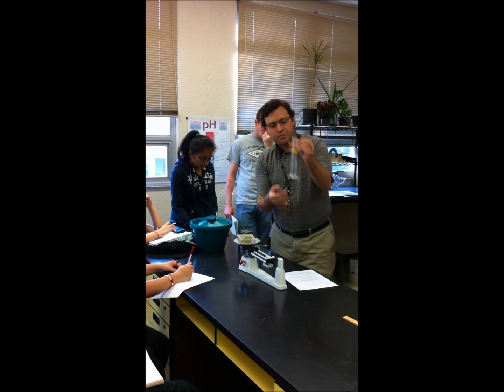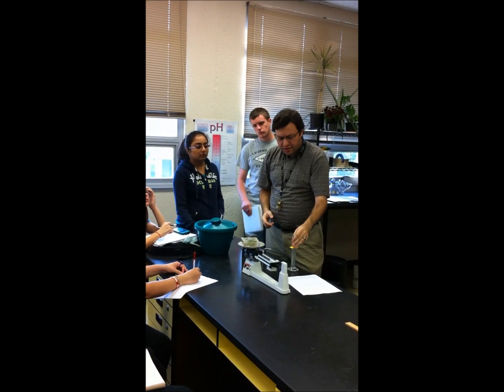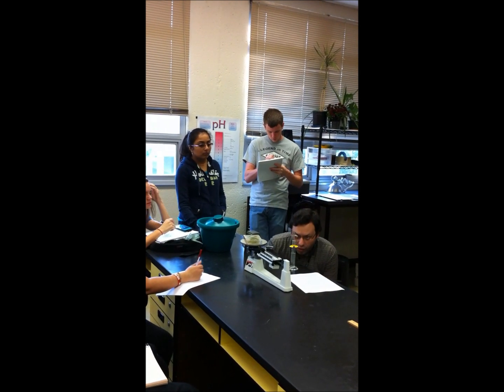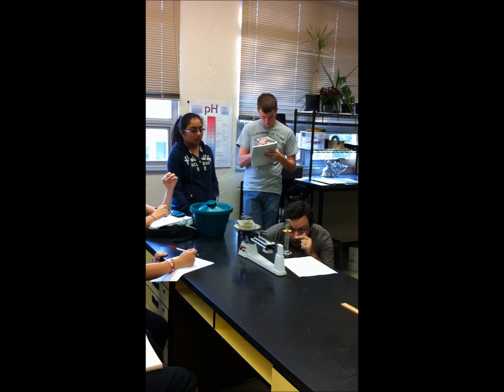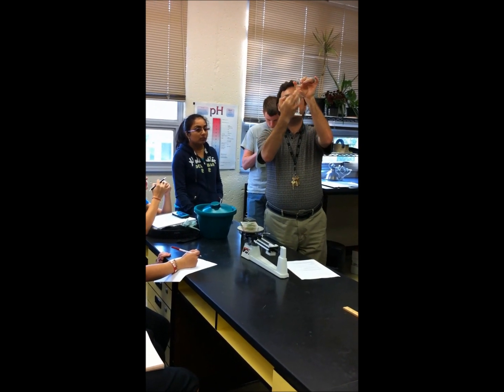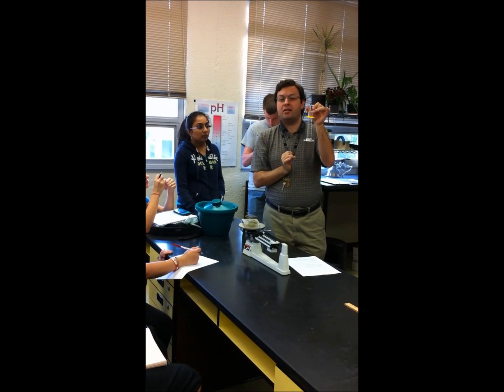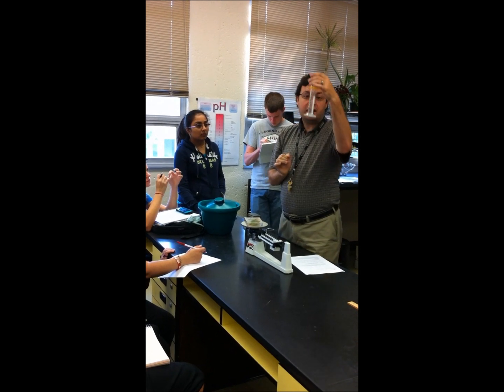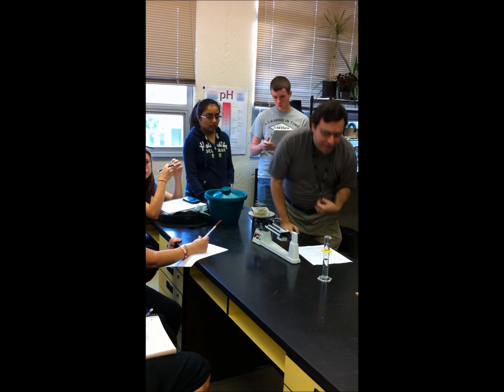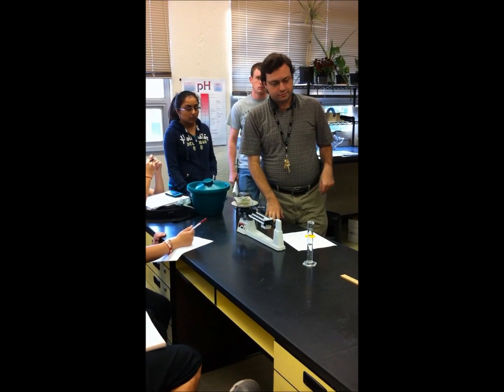With the measurement of volume here with the graduated cylinder, remember, we leave the graduated cylinder on the table to read it, and we get down to the level of the water and put the water at eye level. Okay? We're also looking at, on the water here, there's a distinct curve called a meniscus, and we are looking at the bottom edge of that curve from where we do the readings. Like this one right here is set, well, like I said, you're not supposed to read it from the air. It's set at 30 milliliters right now.